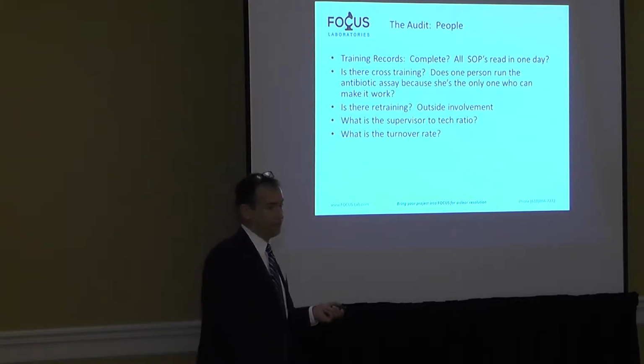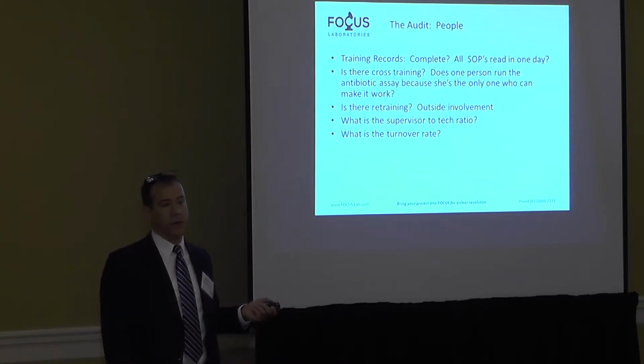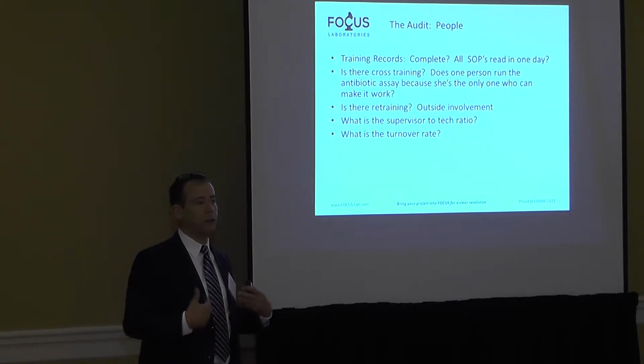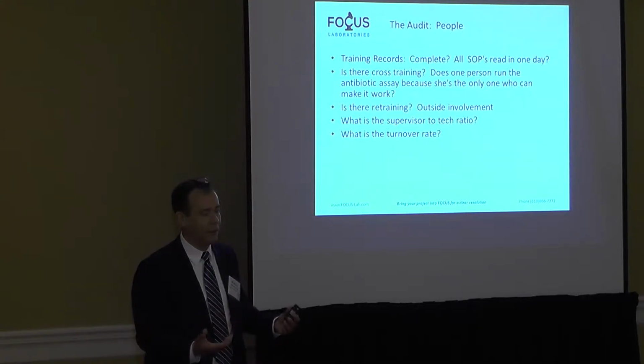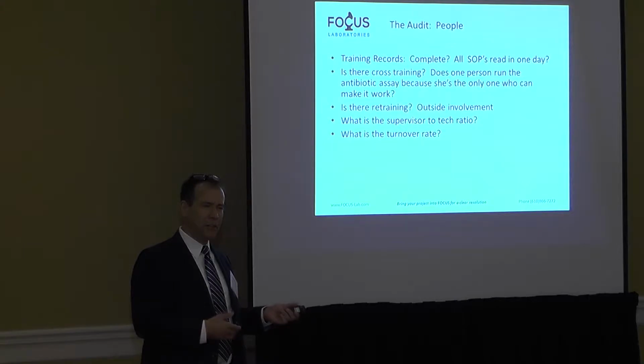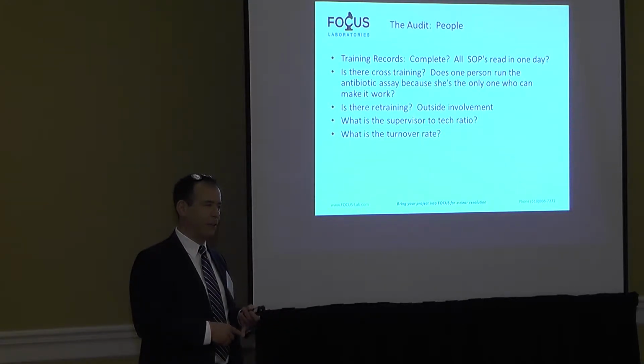What's the turnover rate? Now, this is a perennial challenge for anybody in the contract lab industry. I referred a few slides back to our profit margins. They're really based on our sweat equity. We don't have a product. So we get these kids out of school, and they don't teach GMP in college. They don't even teach gram staining, it seems like.